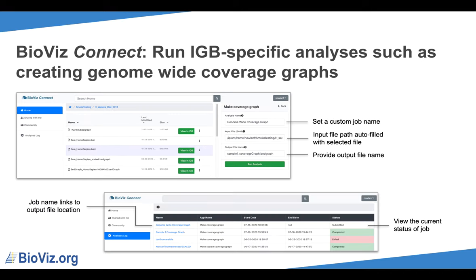You can also run analyses on select file types. We are currently prioritizing analyses that produce output for viewing in IGB. For example, right-clicking and selecting Analyze on a BAM file will provide two options: the first is for creating a genome-wide coverage graph, and the second for creating a scaled genome-wide coverage graph — both are very useful for RNA-seq or ChIP-seq experiments. Once an analysis job has been submitted, you can check on its status in the analyses history in the left panel. There you can see information for every job run and their status. Once an analysis job has been completed successfully, click on the job name to go directly to the output file.